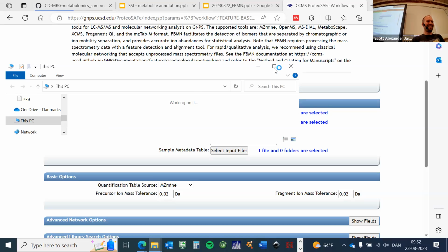So there are a couple of questions online. Will you answer them in the chat? I think it's relevant to people here too. It's like, where does the metadata come from? And people need to generate it, it's not an output, right? I'll show it in a second. It is in a folder higher up.